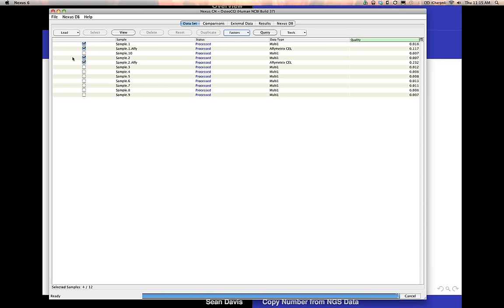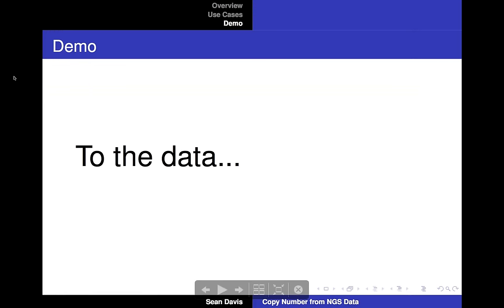Thank you, Dr. Davis. That was a very nice presentation. We do have several questions. I'm not sure if we'll have time to go through them all, but we can attempt to do so. One of the questions, I think it's referring to early on in your presentation, is you mentioned admixtures. Are there methods to analyze copy number variation in admixed populations, such as the Hispanic population?